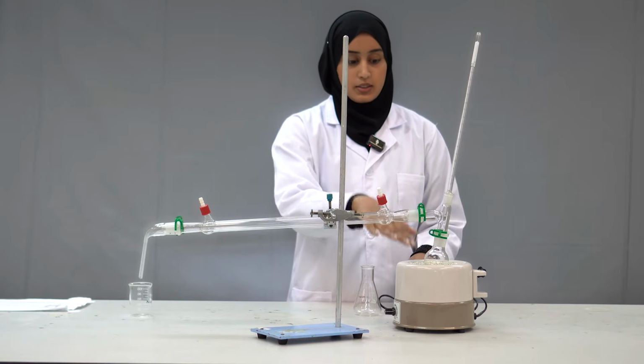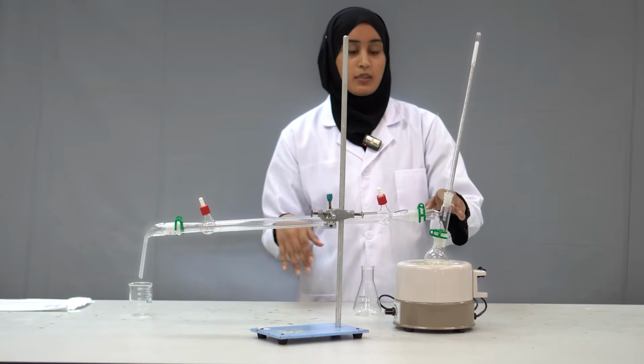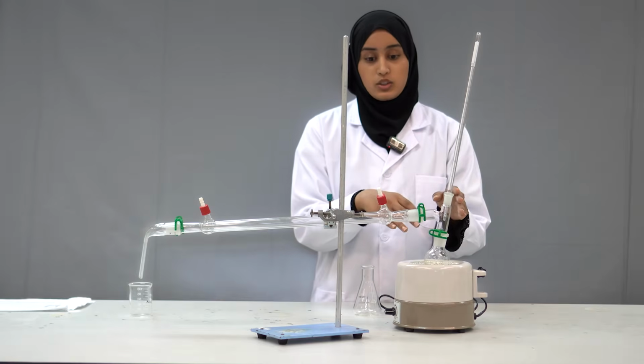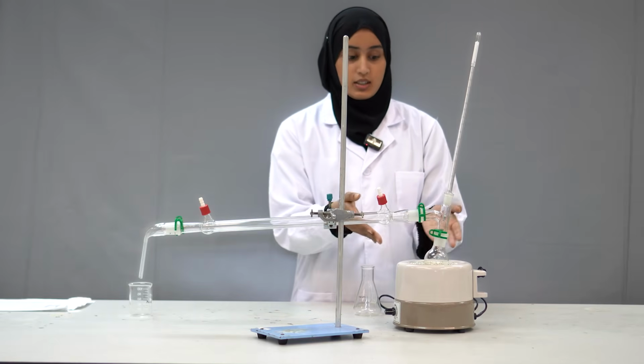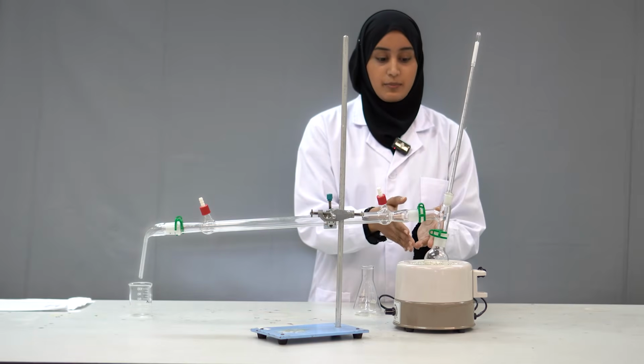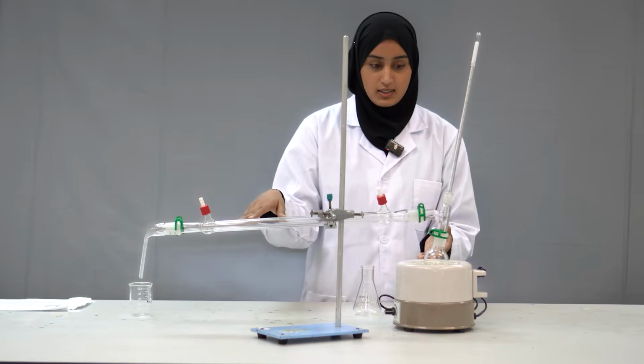Once this mixture starts heating up, we can check the temperature on this thermometer. Now this thermometer actually has two purposes. One is to measure the temperature of the component which is getting distilled.